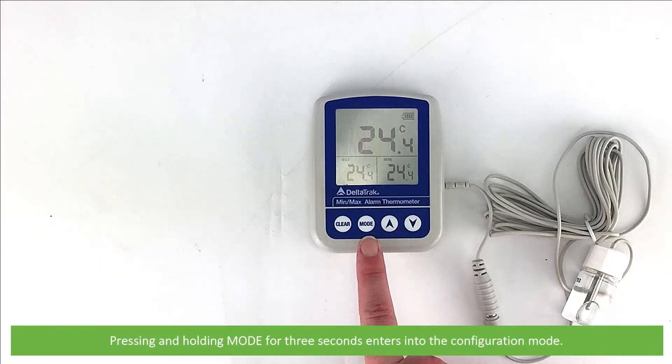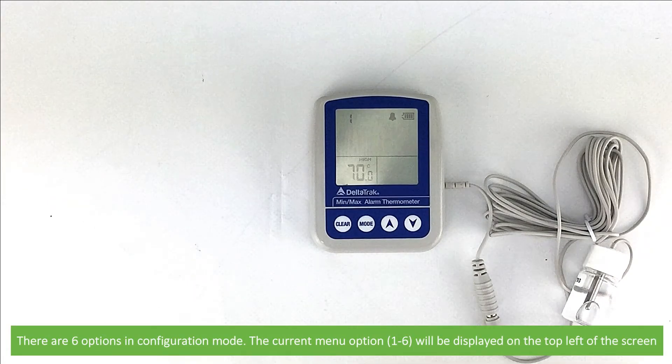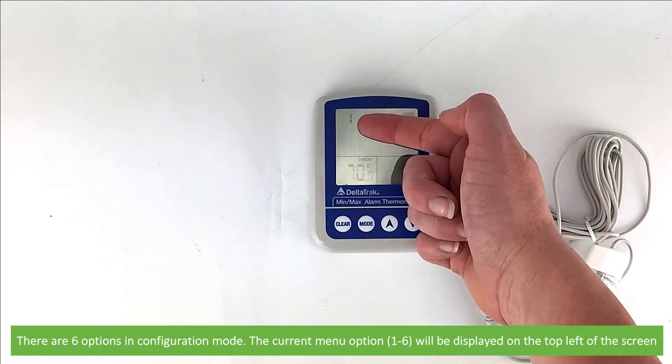Pressing and holding Mode for three seconds enters the configuration menu. There are six options in the configuration menu. The current menu option, between 1 and 6, will be displayed on the top left of the screen.